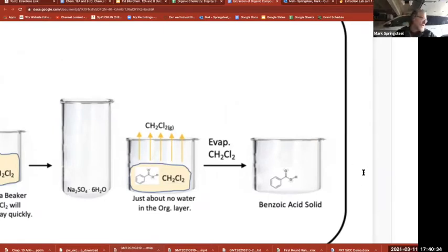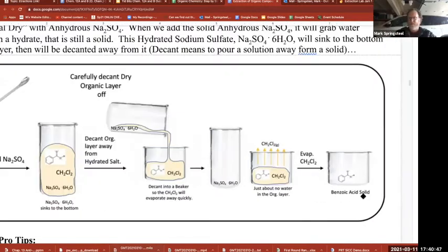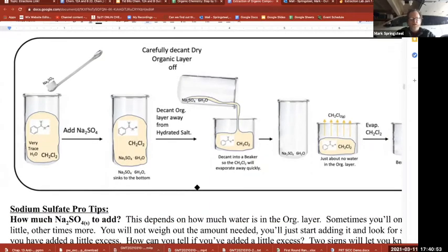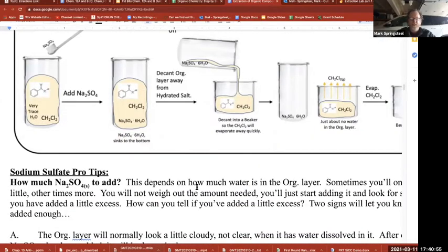There is cool special equipment to remove water from samples in different situations. They have these lyophilizers, and centrifuges that are under vacuum, and they freeze it and sublime it out. It's pretty interesting. But we usually just use the pre-dry brine, final dry sodium sulfate.